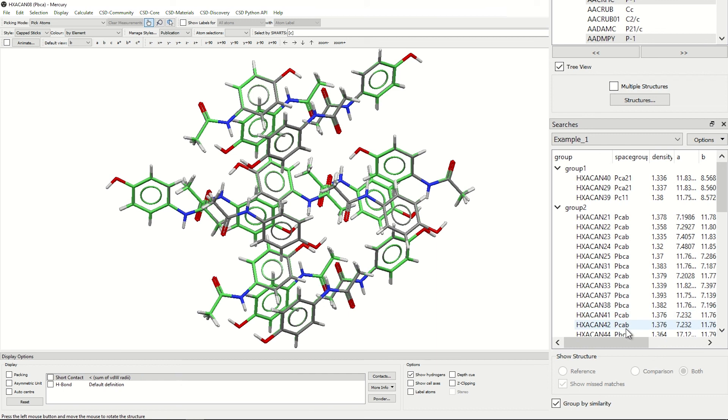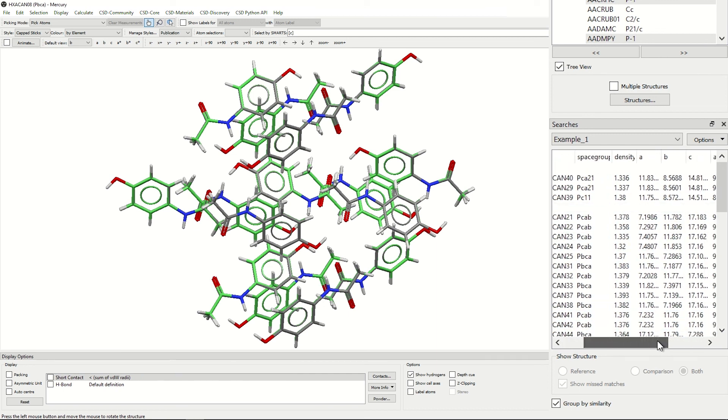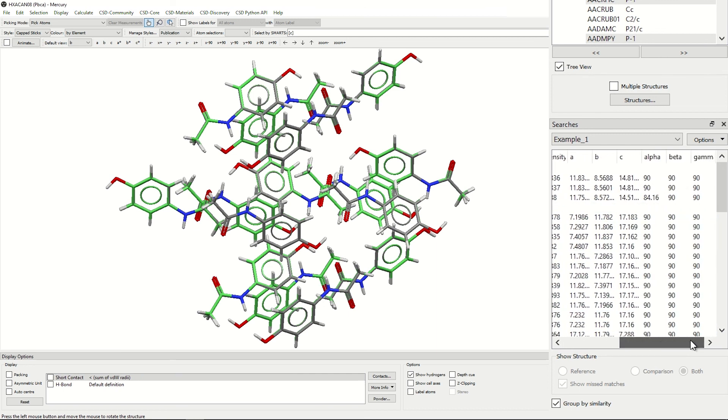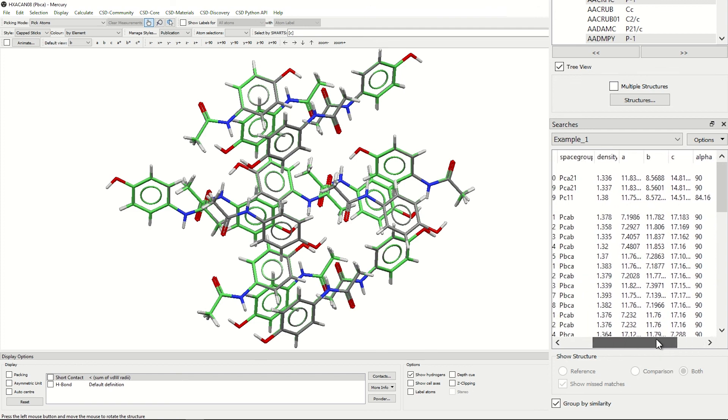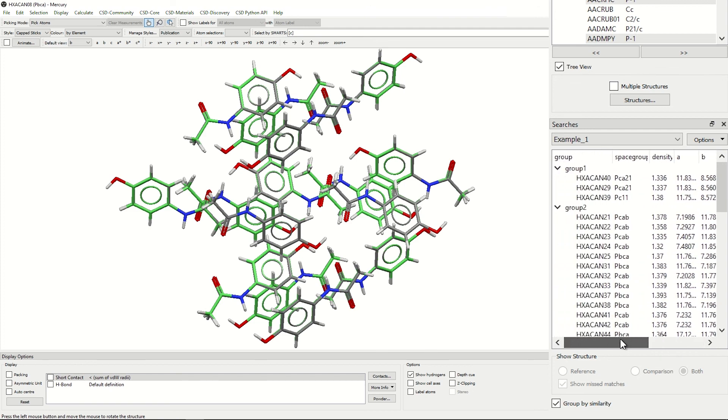You can also see that the space groups, densities, and by scrolling to the right, all of the cell parameters are shown for each individual ref code.